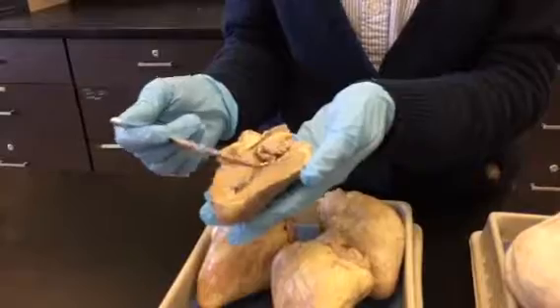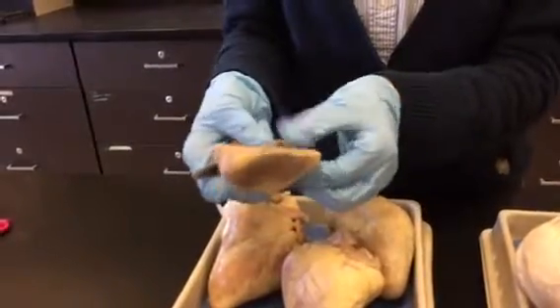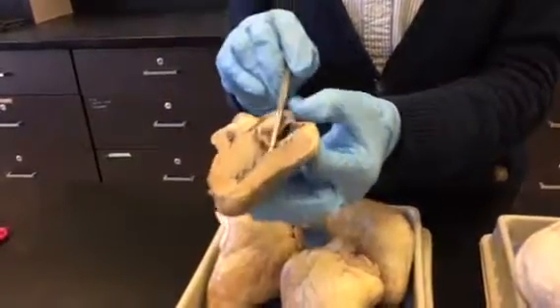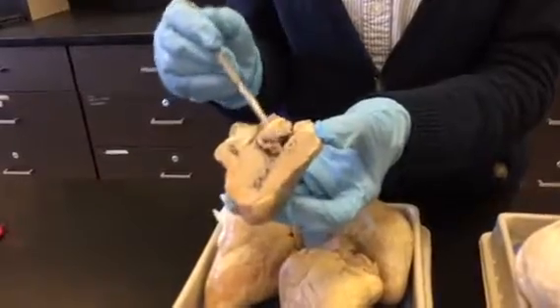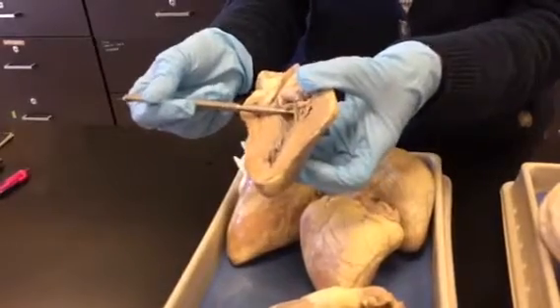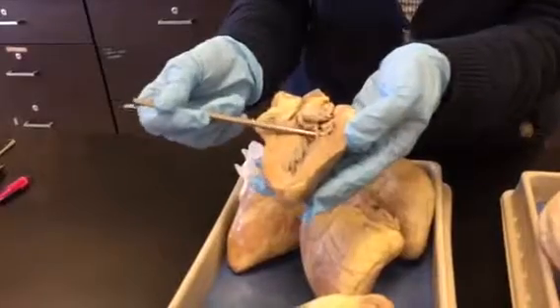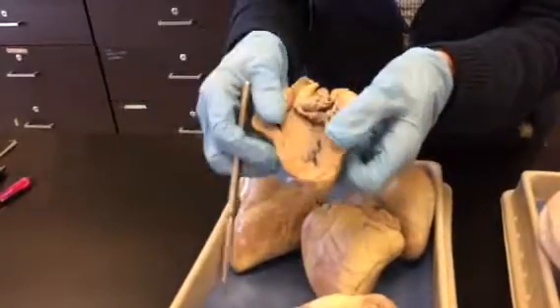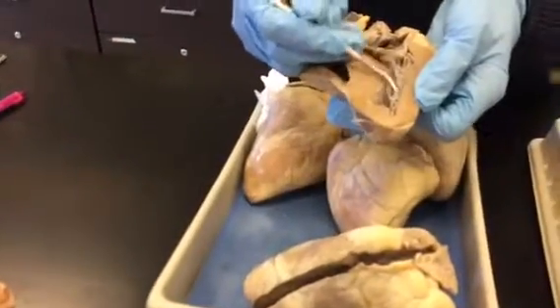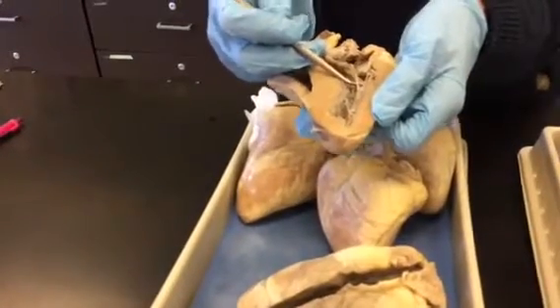Over here is the left ventricle — again, very muscular. Here's what's left of the left atrium. That blood is going to go down to the left ventricle, but it has to go through this valve right here. This is a bicuspid valve — bi means two pieces, so the other half would be on the other half of the heart. Those valves are anchored by chordae tendinae. And on this side you can really see these bumps on the ventricle wall — that's papillary muscle, which actually anchors these chordae tendinae.